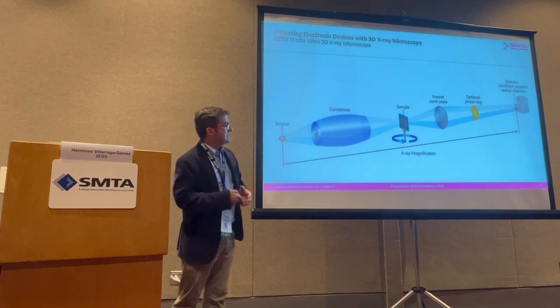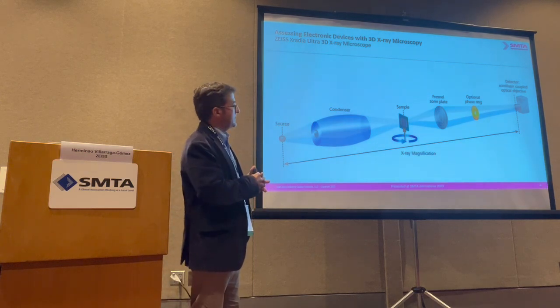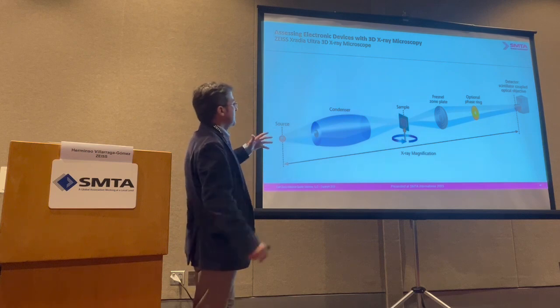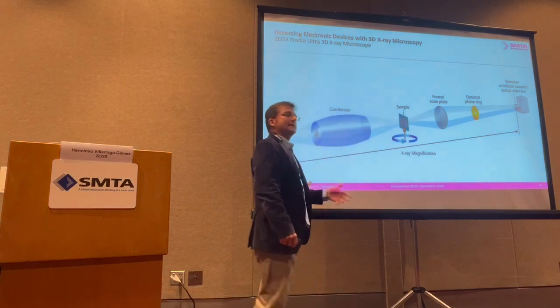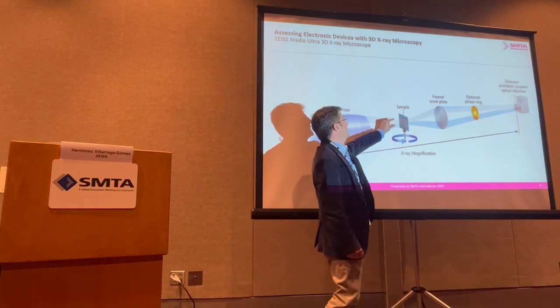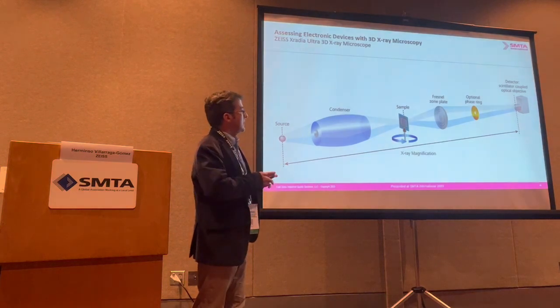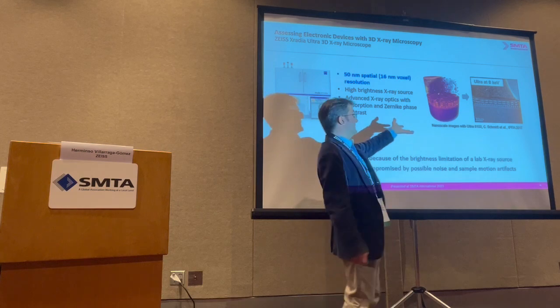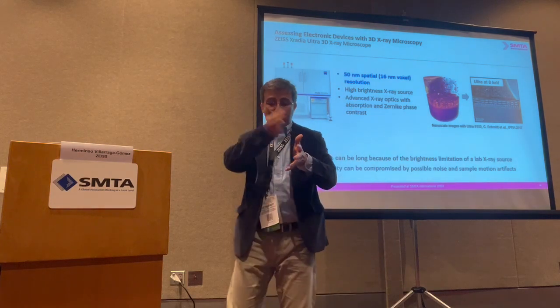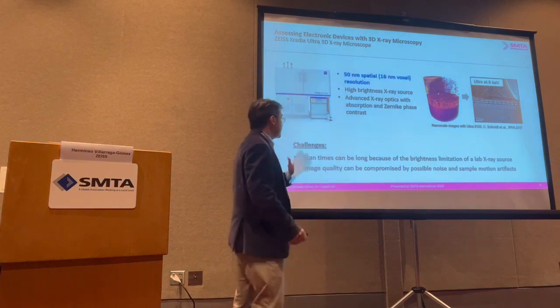Now, if you want to increase the resolution, you will have to even modify the X-ray microscope and maybe use condenser lenses and Fresnel plates. In this case, you will need sample prep because you see that it's a very small region. You will need something in the order of 1 cubic millimeter to be able to scan this. And yes, you get great imaging. It's destructive because you have to prepare the sample, but still it's 3D. You don't have to slice the sample, so it's not invasive.